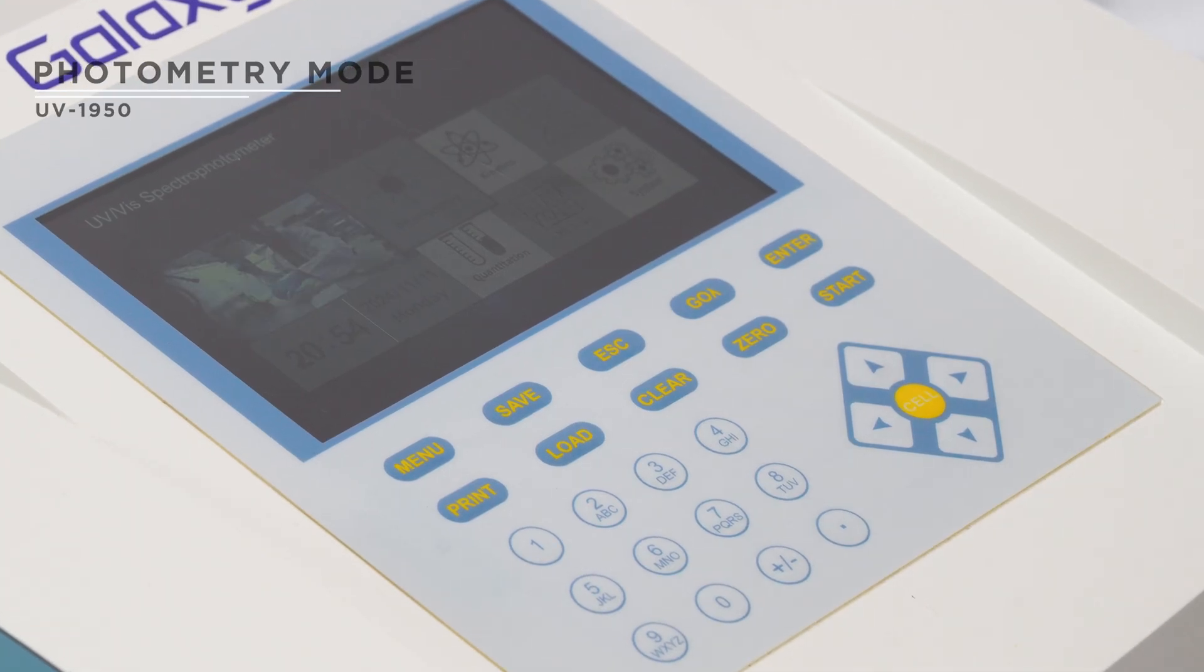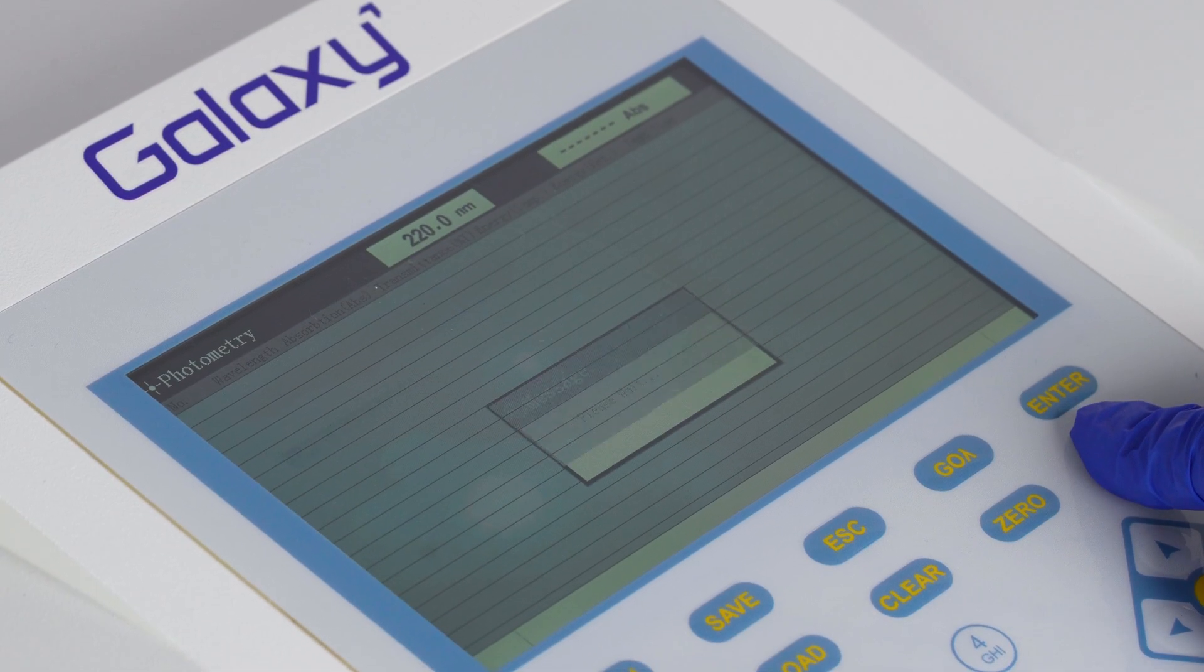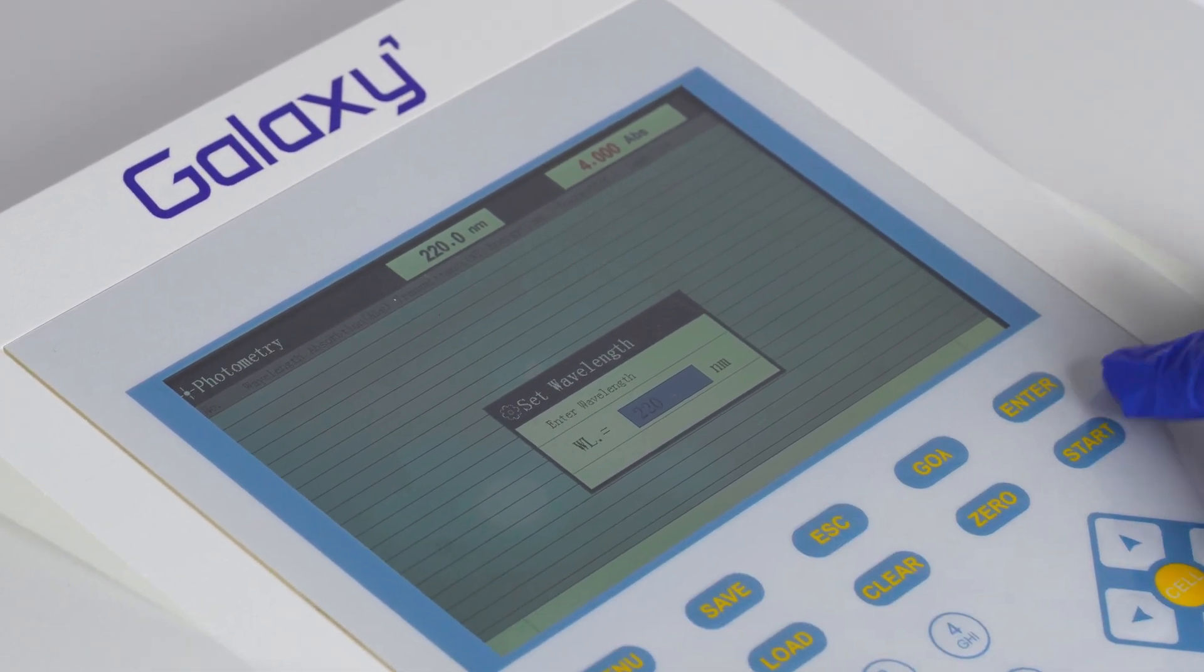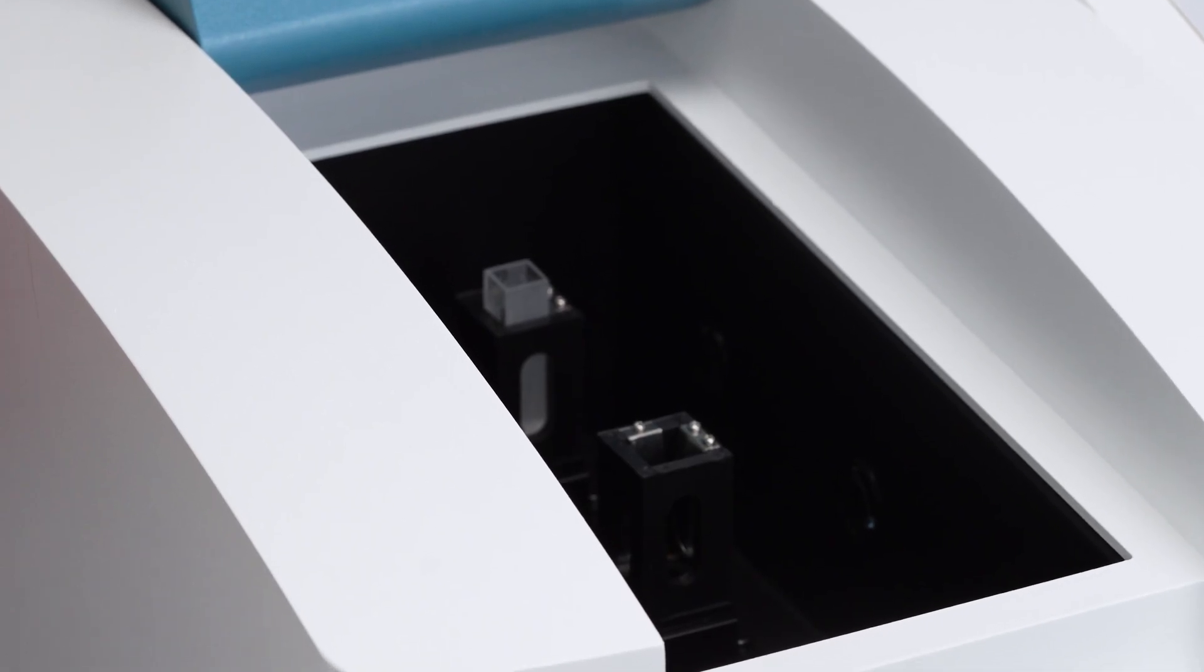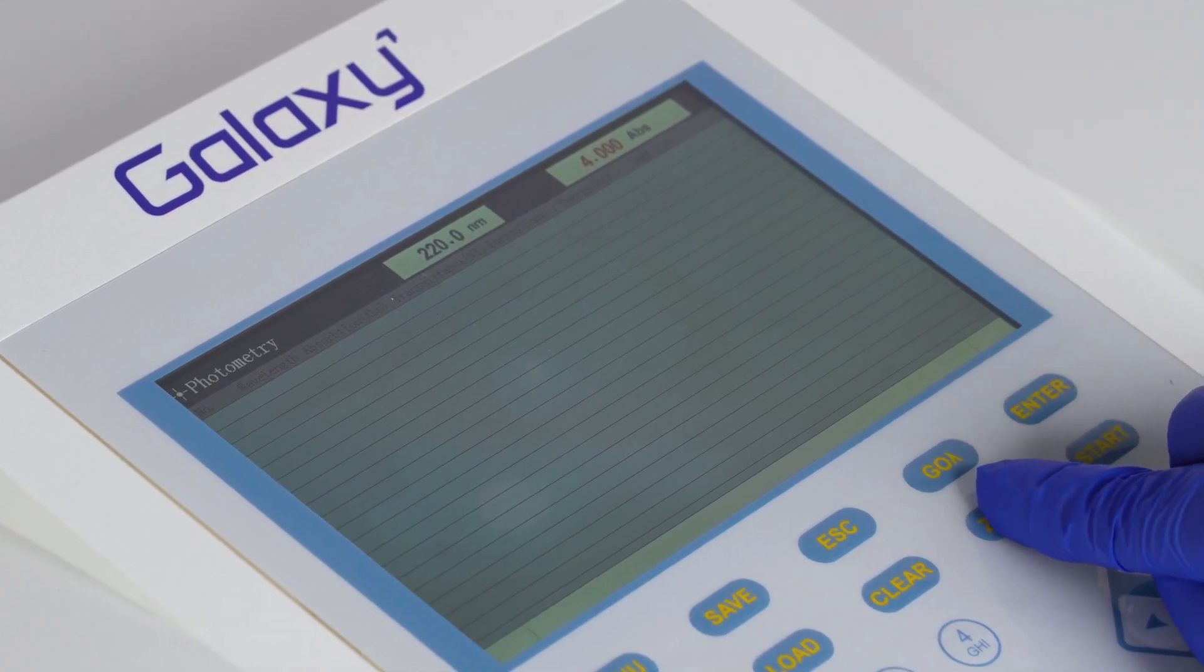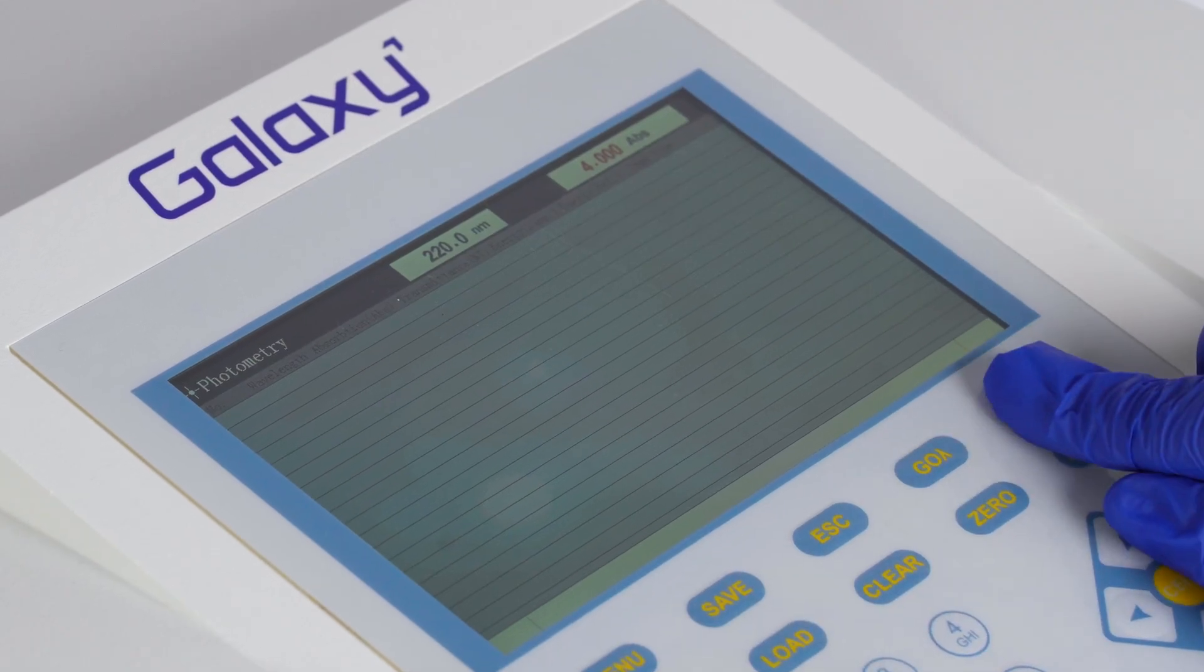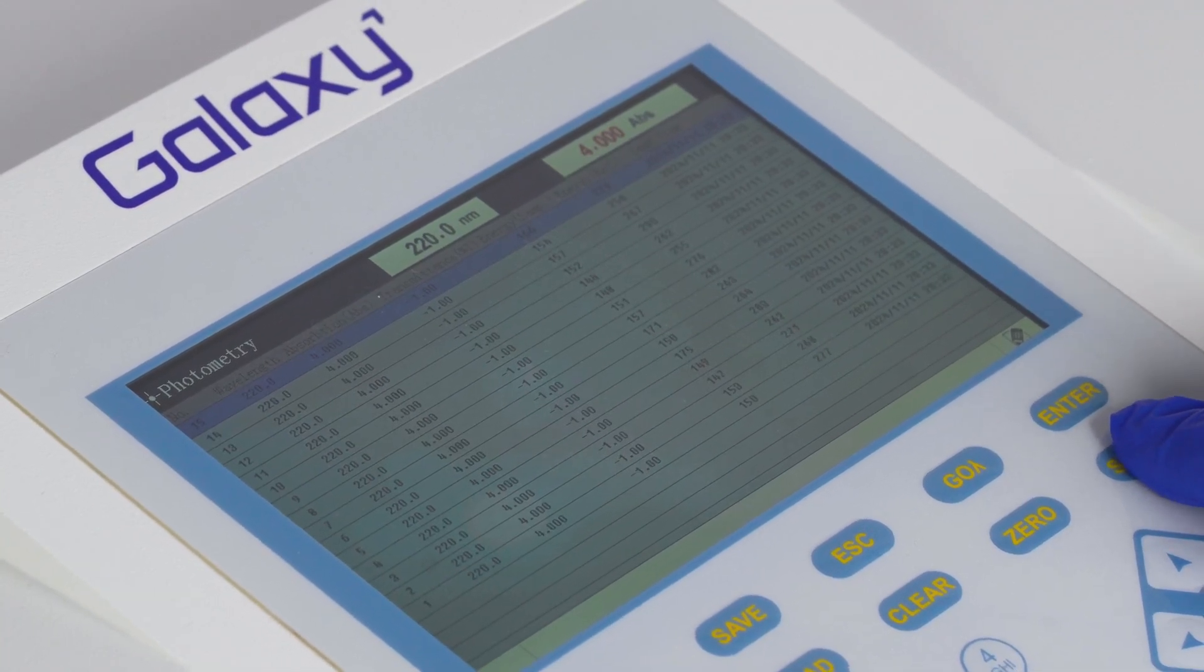In photometry, to measure absorbance, press enter to select photometry. Press go lambda to input the desired wavelength and press enter. Place a blank cuvette in front of the light source and press zero for blanking. Insert the sample into the sample holder and press start to read the absorbance. The reading will appear on the display.